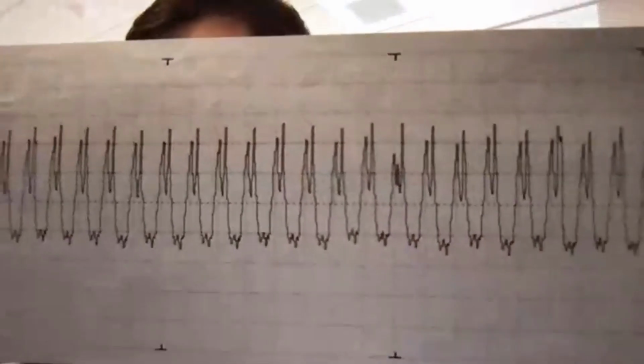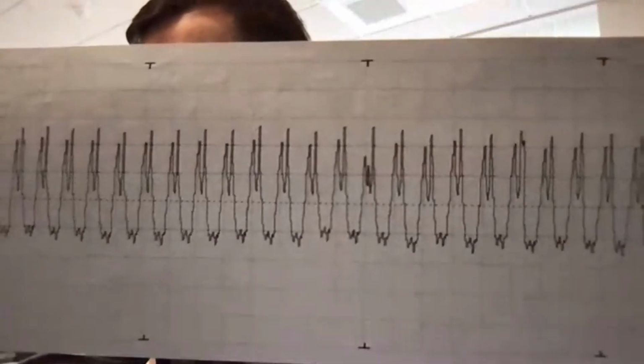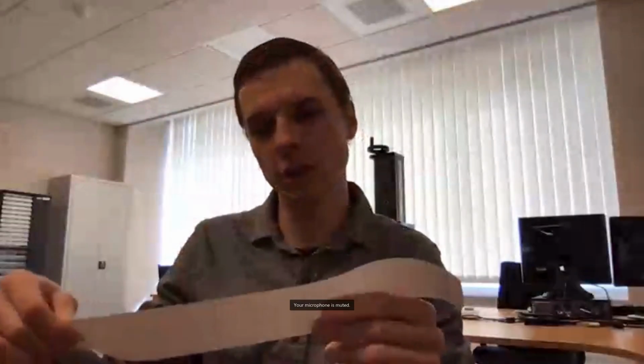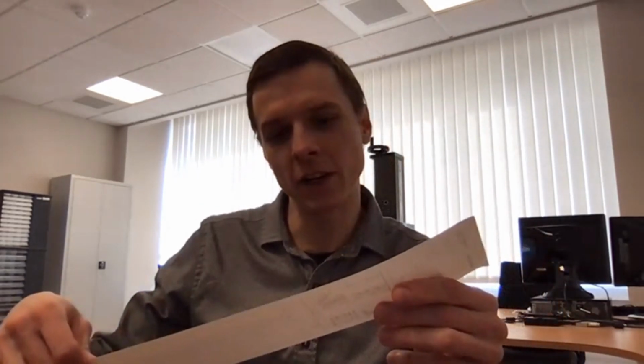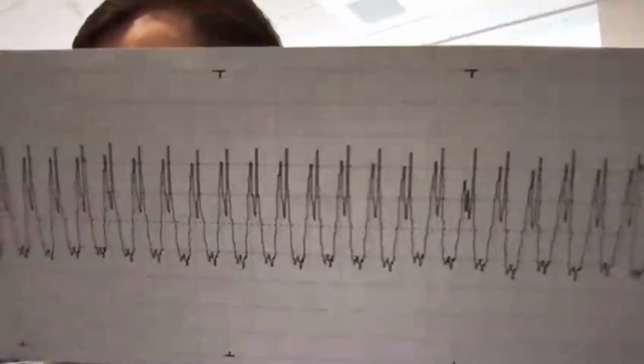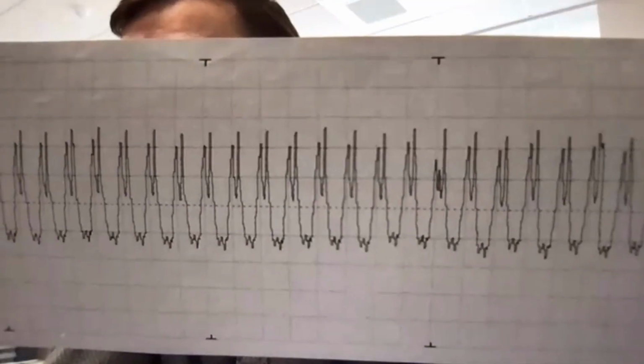Honestly, it's very hard to imagine that any surface is this rough, but the magnification in the vertical direction in this specific case is 2000 times. So basically, sorry, it's 5000 times. So you take this profile, shrink it down 5000 times, and you have the real scale interpretation of how smooth or rough your surface is.